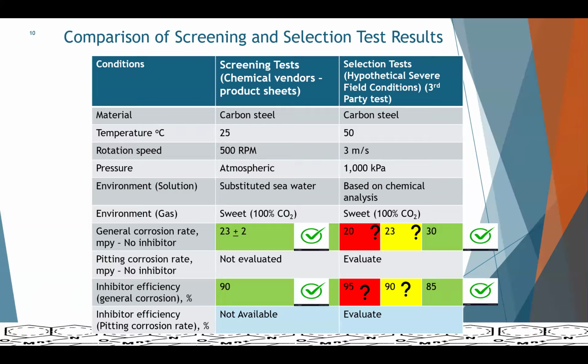So we are doing the same thing that we have been doing, but we are tying everything to the precision statement. Sometimes people also use localized pitting corrosion. Normally, localized pitting corrosion is not evaluated in the screening test because of the shorter duration of operation.